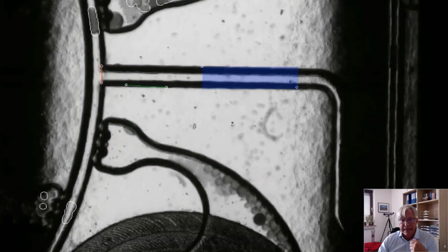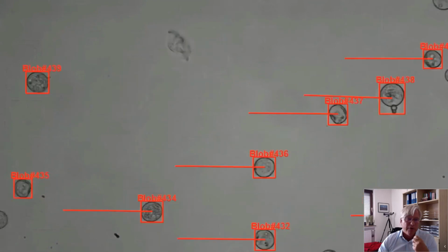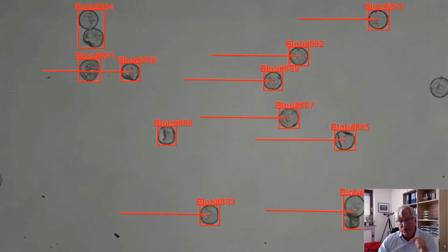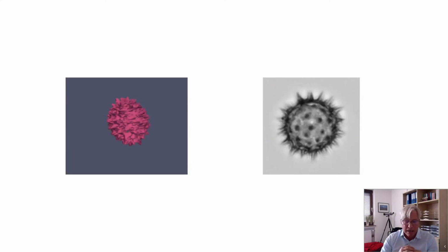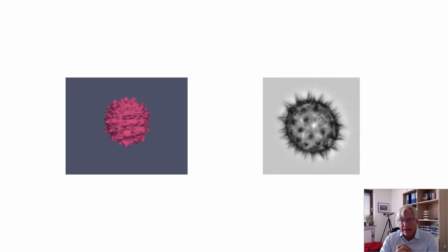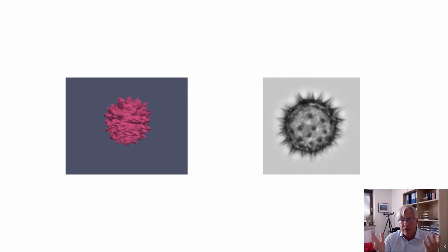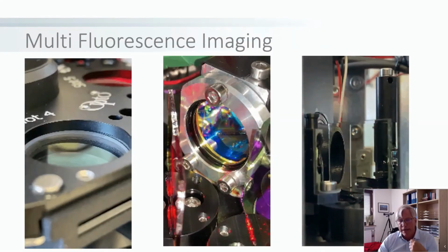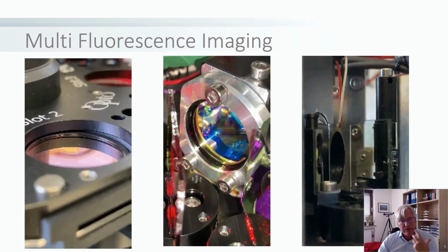We are screening cells, or making a blob analysis, where we have hundreds or thousands of frames per second, tracking a small flow, making images of a particle, or here a pollen, to make really 3-dimensional renderings, because we believe that morphology is coming more and more into account for making diagnoses about diseases.